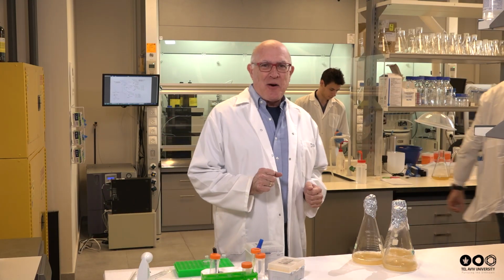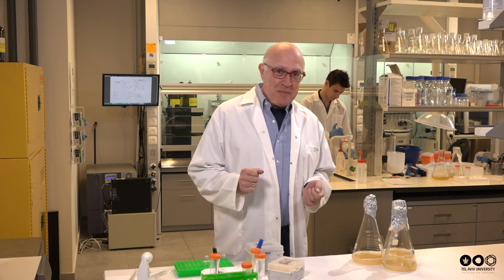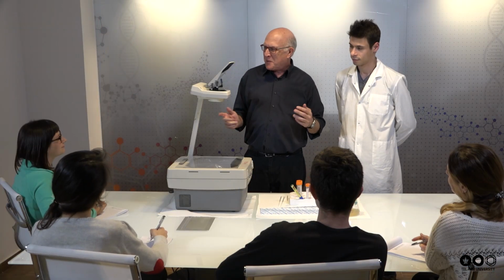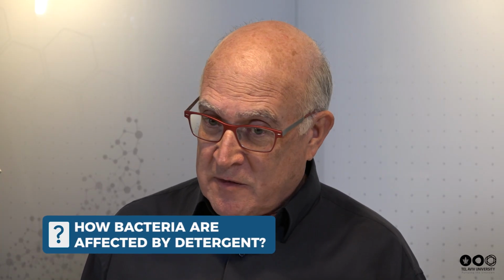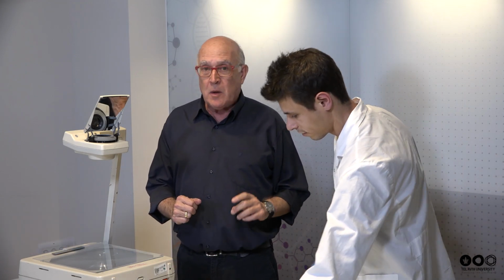Great. So at this point, all we have to do is set up the class. Michael, come on, help me set up the class. Hi, so welcome to the mini class. Today we're going to discuss and examine how bacteria are affected by detergent. And so for this, Michael, please take some of the bacteria and add equal amounts to 2 test tubes.